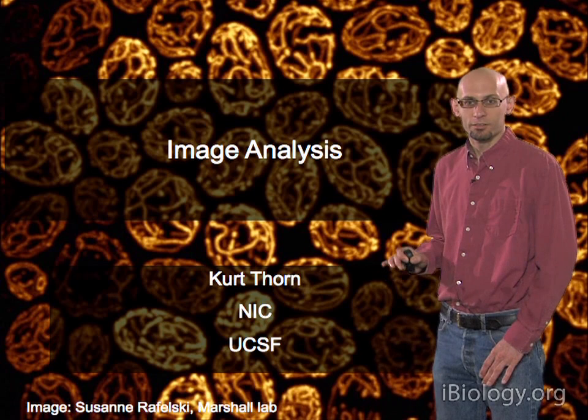So along with filtering, these binary operations are a real workhorse in digital image analysis. And that's really all I wanted to say today. This is just designed to give you a taste of the tools that go into digital image analysis.